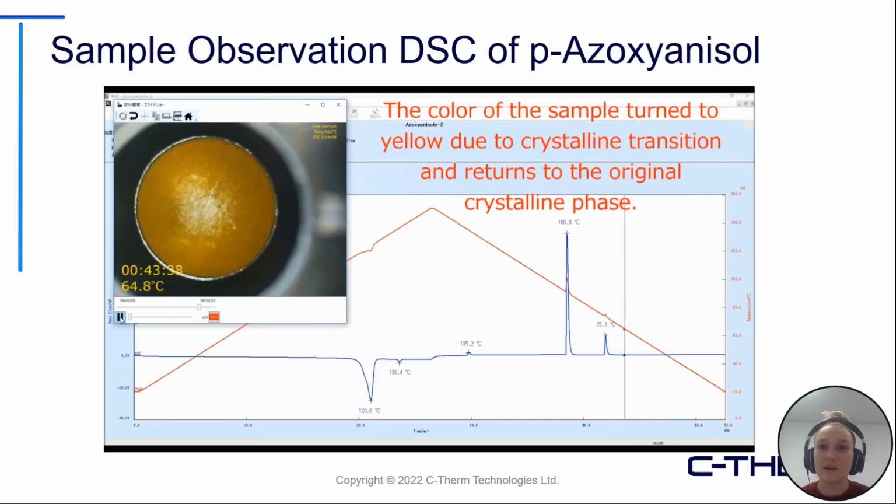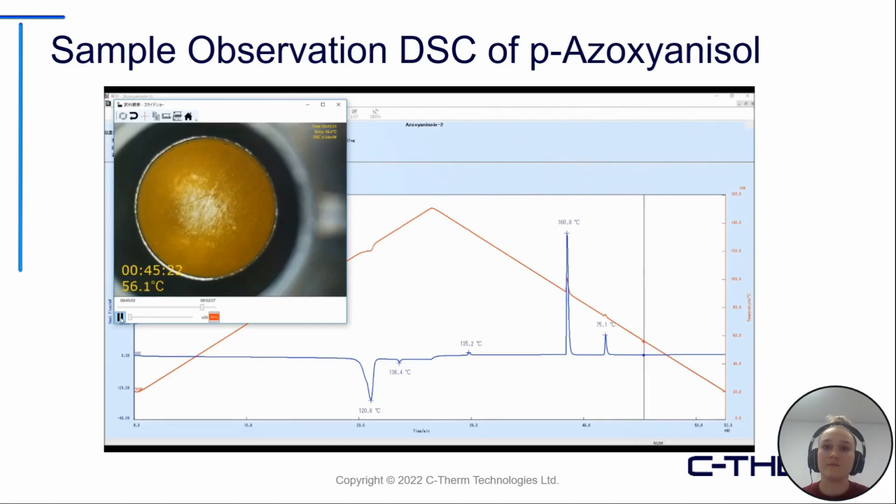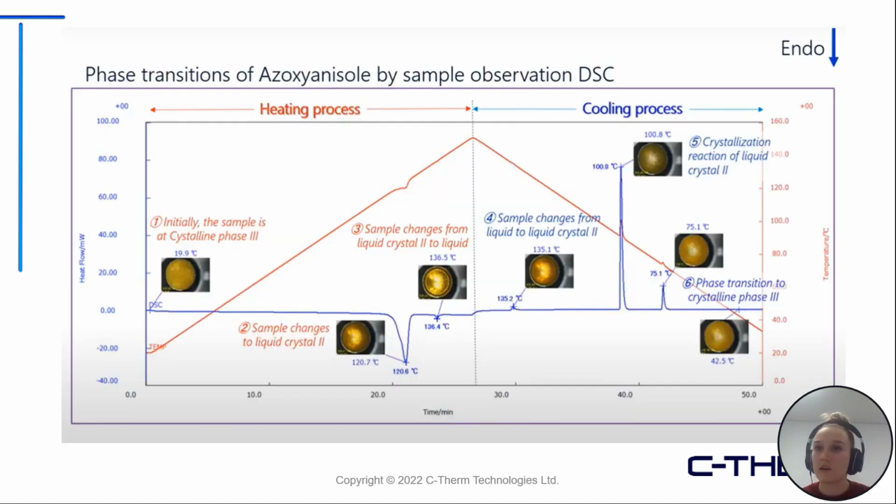And as we can see there, I'll just point out on that image, you can always see the test time and the temperature always correlated on the video. Okay, and then again, just showing how you could present this in either a paper or maybe a report, just showing how the sample changes through the test.